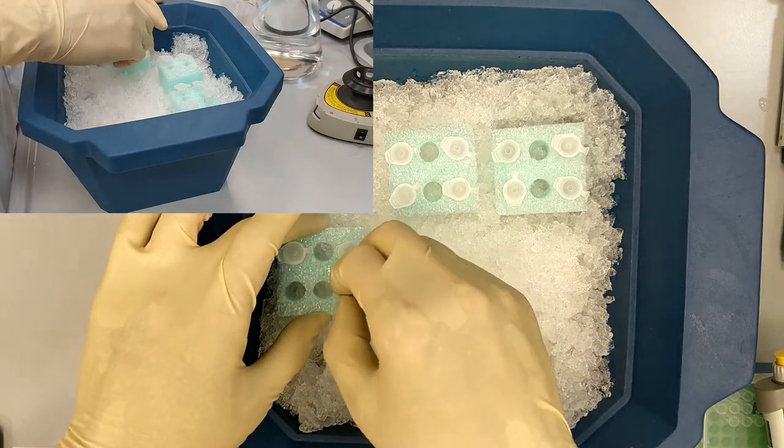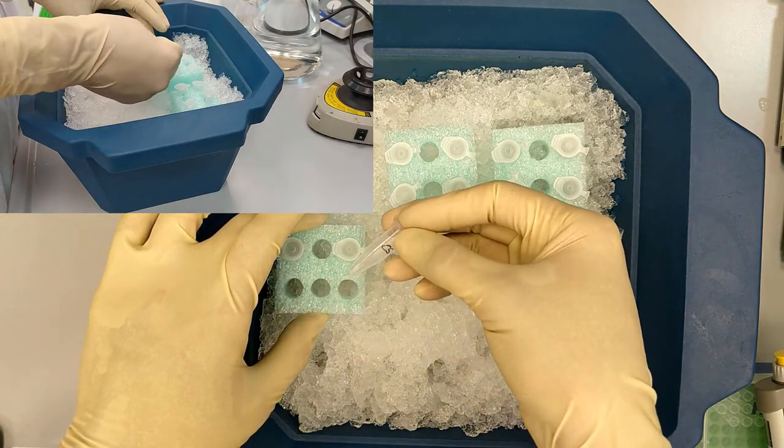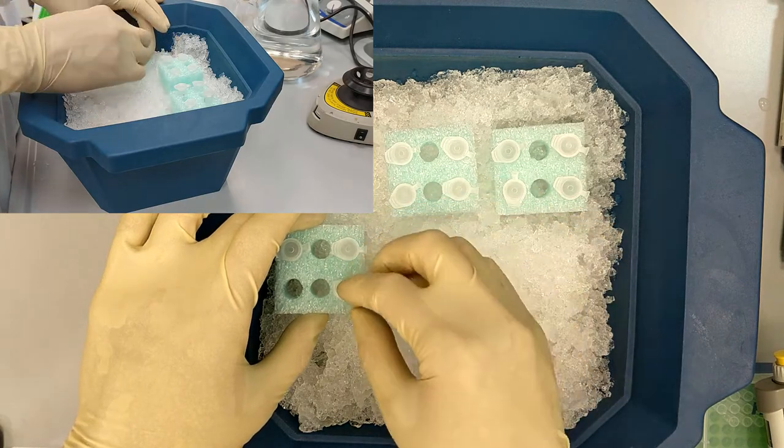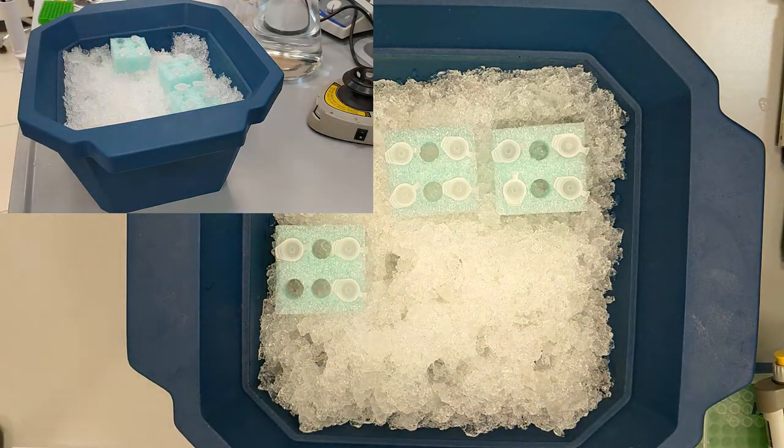Okay, so for now, we start with the addition of 10 microliters. And again, we will be changing the tip after each use.